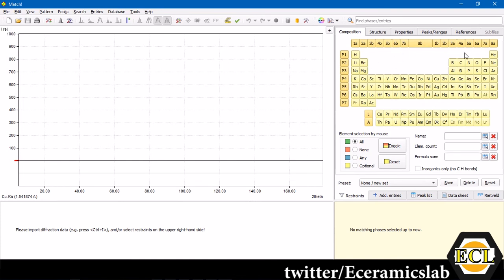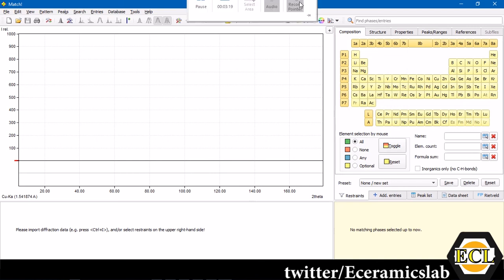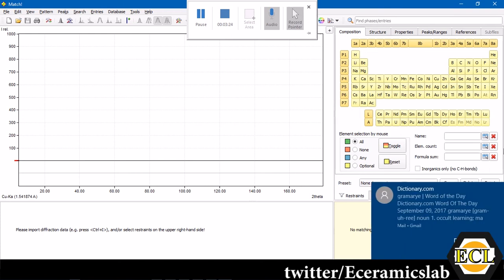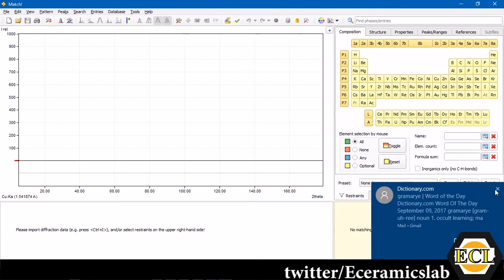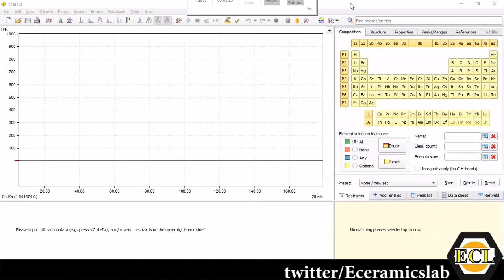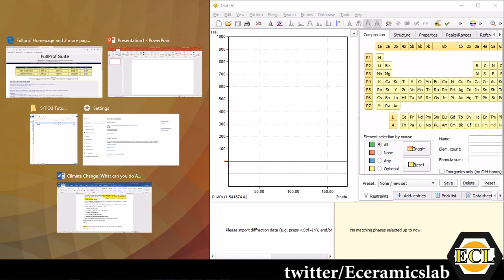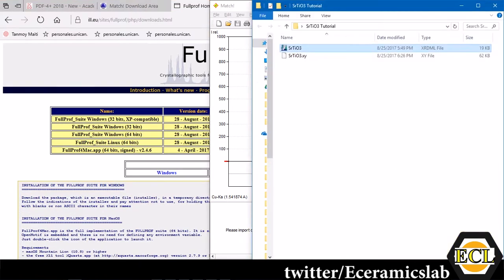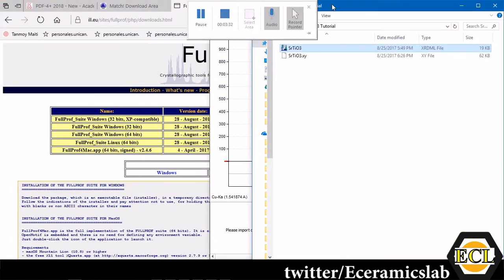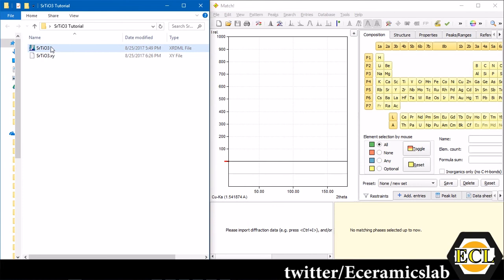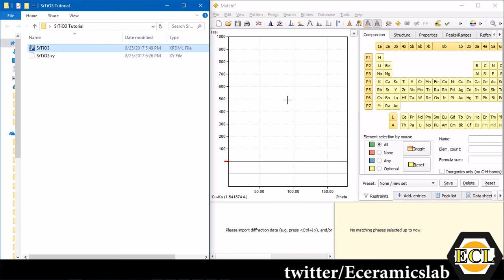Here you have on the right hand side a periodic table. From this periodic table you can select the elements which are there in your sample and from there you can search various phases which are possible in your system. I'll quickly drag and drop one strontium titanate xrdml file.